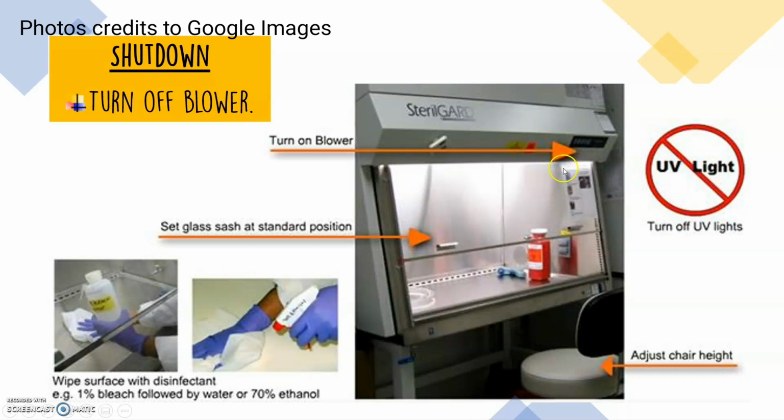As you can see here, this is the blower. Before, of course, you have to turn this on. But after, you have to shut down and turn off the blower.